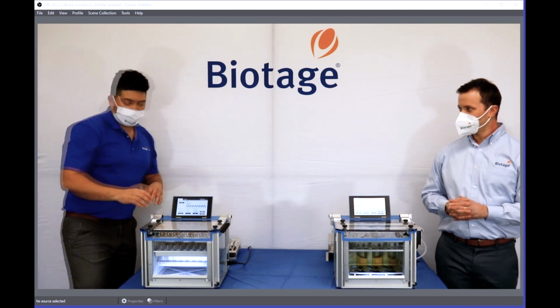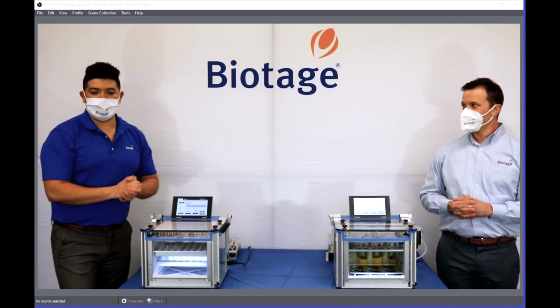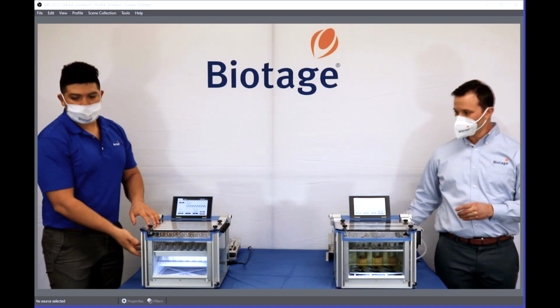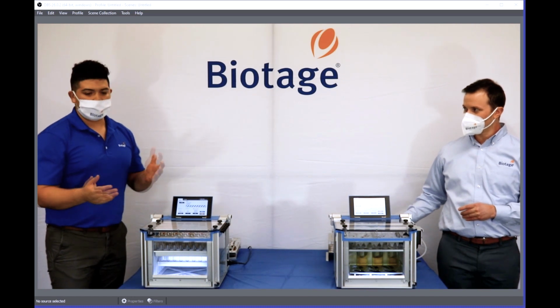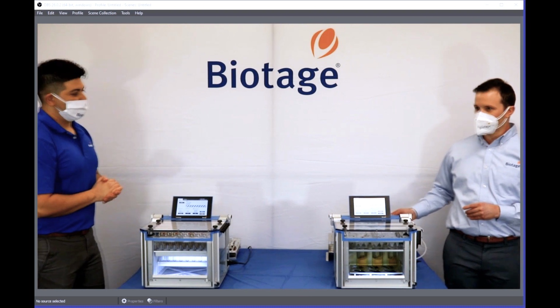Now that your evaporation is done, the maintenance. Many of you may be familiar with the older system and how cumbersome it was to really empty this water bath or change out that water bath for new water on a weekly basis or daily basis, whatever protocol you were using. Now we have a nice simple solution to overcome that issue.